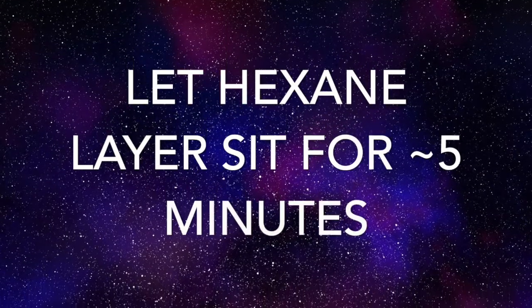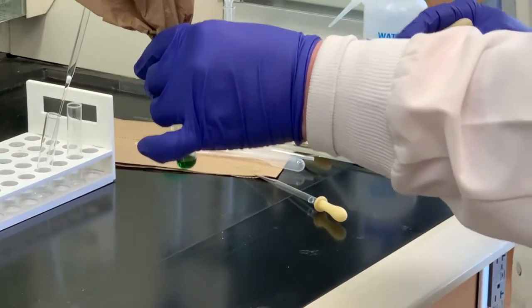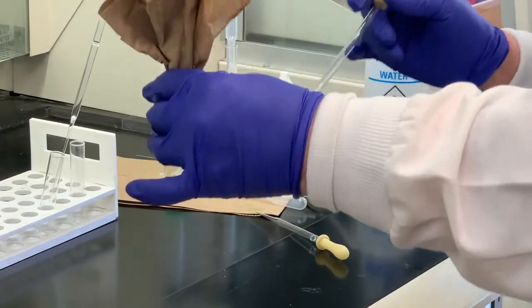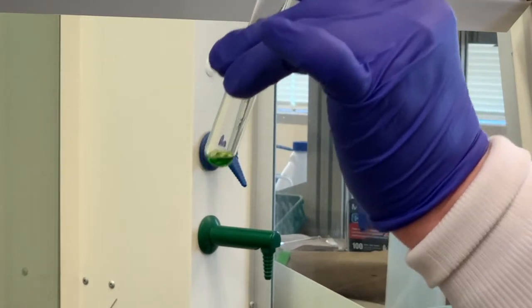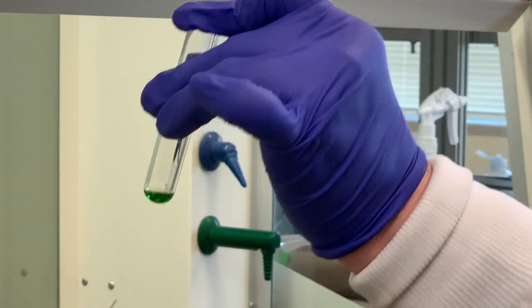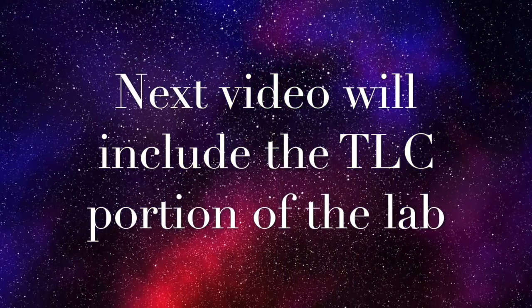It's been several minutes with the hexane organic layer, containing the chlorophyll pigments from the spinach, sitting with the drying agent. Now I want to pipette the organic layer, leaving behind the drying agent, into a clean test tube. We have a very small amount of liquid, but we don't need very much. I'm going to get my chromatography sheets prepared and stopper this so none of it evaporates. When we come back, we'll be spotting our plates and carrying out the rest of the experiment.